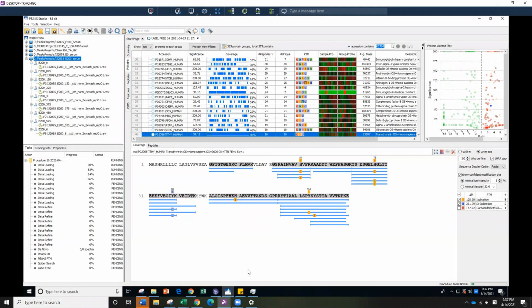Okay, as we are waiting for that, this is also what you are going to see at the beginning. If you see something is running, you can see a procedure. Sometimes, if people are actively running analysis on a computer, you will see a couple of folders queued up, but none of them are running or have any percentages yet. That means if you start analysis on that computer, you will be waiting for a bit. So this is how you start your peaks analysis.